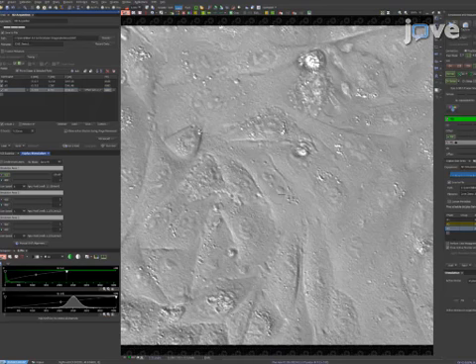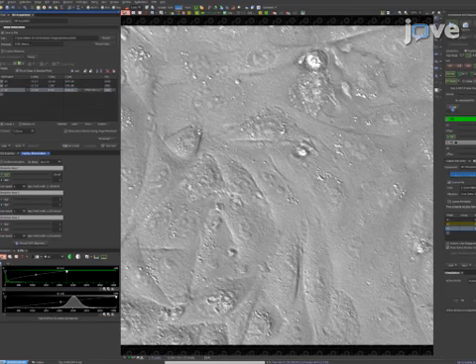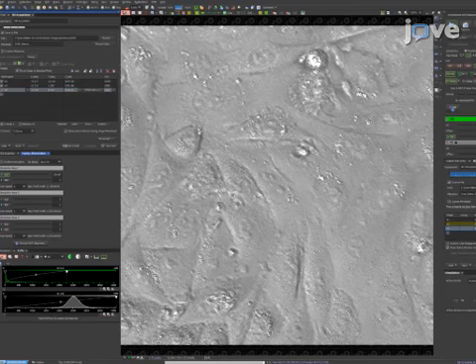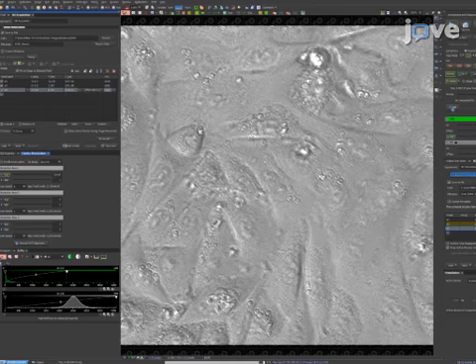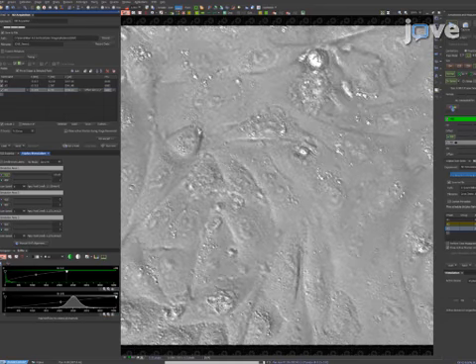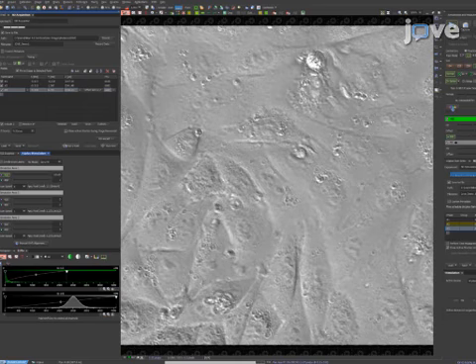Select a clear feature within the nucleus, such as a nucleolus, and move the focal plane up and down while observing this change in appearance. The true focal plane will lie within the transition from light to dark. To focus the sample, select the focal plane in which the selected feature has the sharpest contrast.